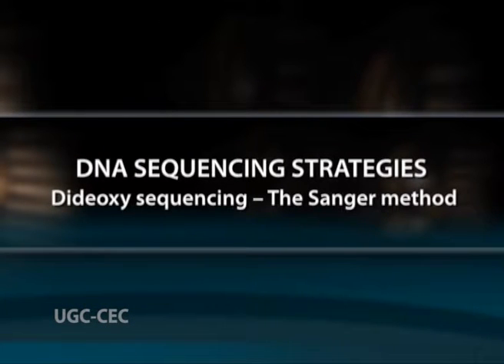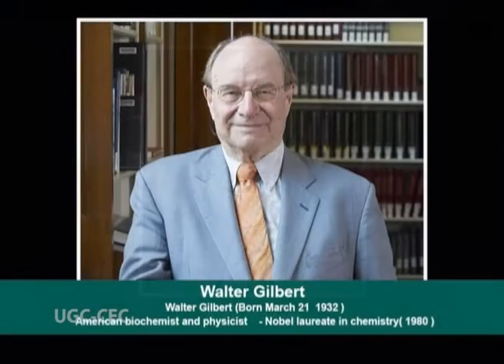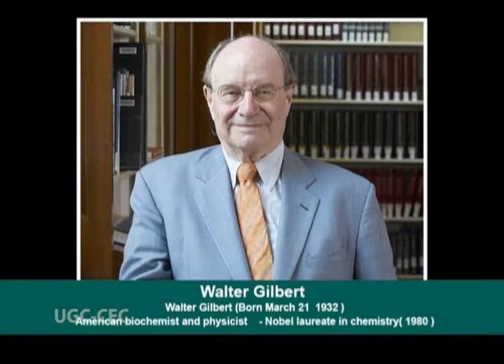DNA sequencing strategies: dideoxy sequencing or Sanger's method. So-called first generation sequencing technologies, which emerged in the 1970s, included the Maxam-Gilbert method, which was developed by Alan M. Maxam and Walter Gilbert, and the Sanger method or dideoxy method, which was developed by Frederick Sanger.